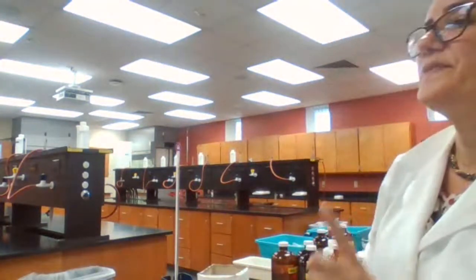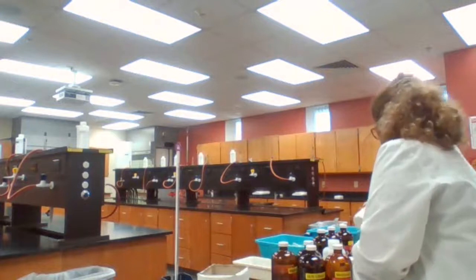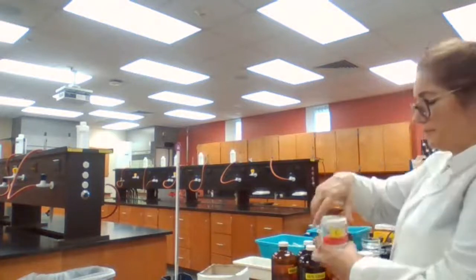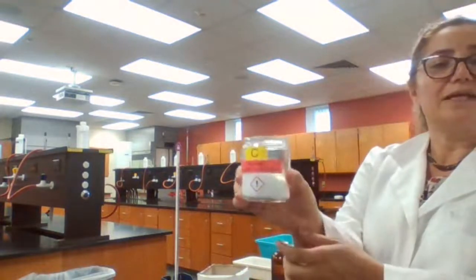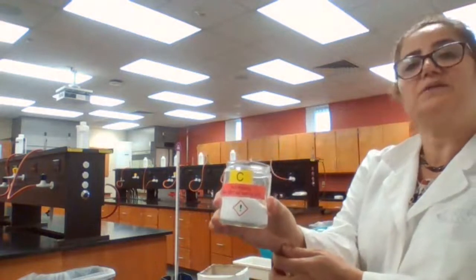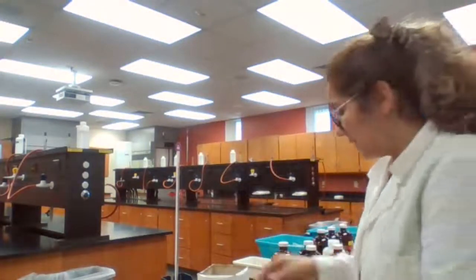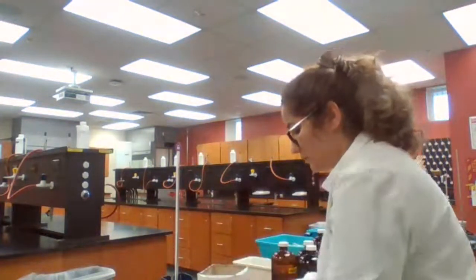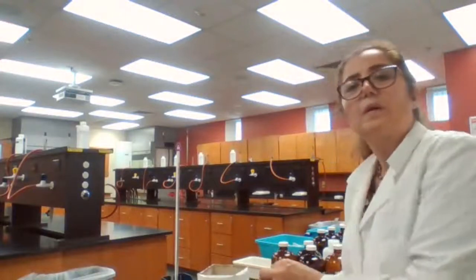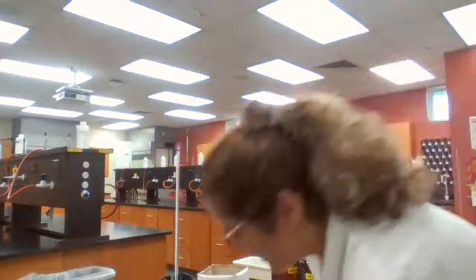And while this one is melting, since I need to find the melting point for the unknown, I am going to prepare the unknown sample. I'm choosing letter C. You want to take a screenshot or write down letter C, either one is fine. I'm picking letter C for unknown. For experiment A, for melting points, I'm using letter C of unknown.